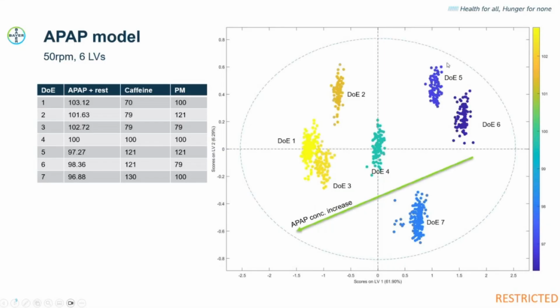And you can see here in the scores plot, I usually like to present it color-coded because that is the easiest way to get the information of what a scores plot means transferred to anyone who's not into PAT and multivariate data analysis. So I've tested it.